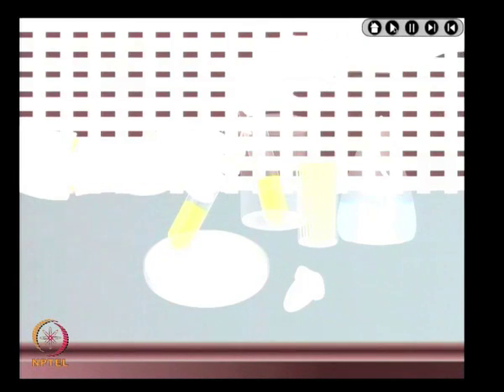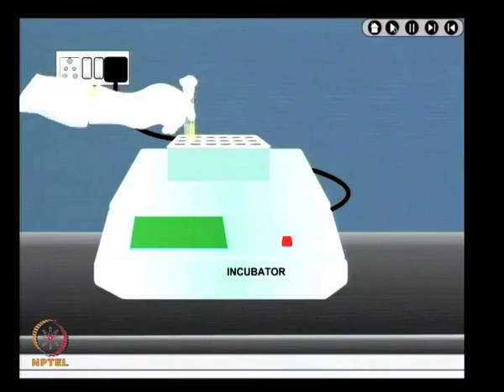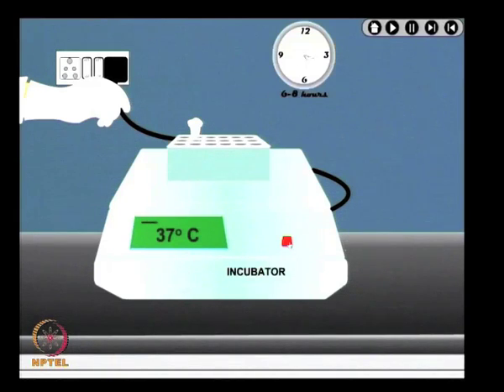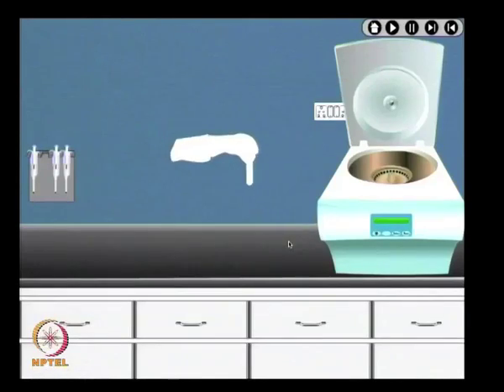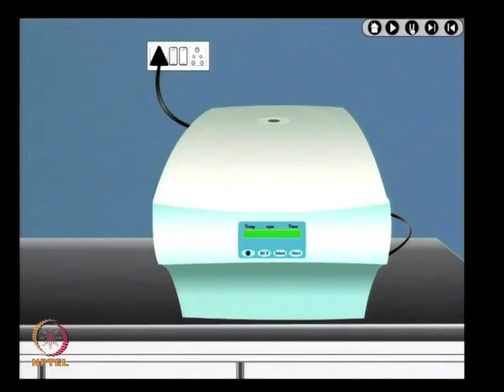For any bacterial proteome analysis, first you need to grow the bacterial cultures on LB media containing a suitable antibiotic. Now, the proper 37 degrees temperature is provided for overnight or 6 to 8 hours of growth. The overnight cultures are diluted with fresh LB and grown at 37 degrees for 6 to 8 hours. Continue growing the culture till it reaches the mid exponential phase.